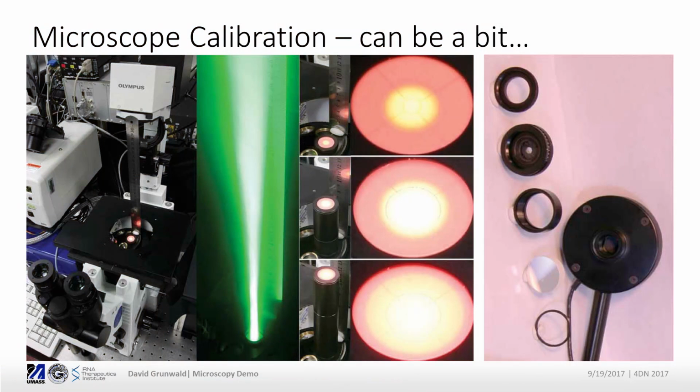And what we basically tell you in this paper is, well, if you want to do that, you need to take a power meter that has a thermo head. It's also not news. It's just news to our community. And then install like a profile, get an idea of what your beam profile looks like. It's involved. Doing that can easily take you a day when you know what you do, and the first time that you figure it out, you'll be busy a little longer.